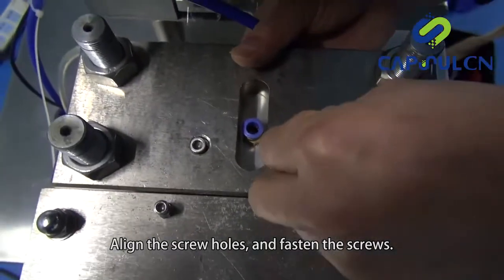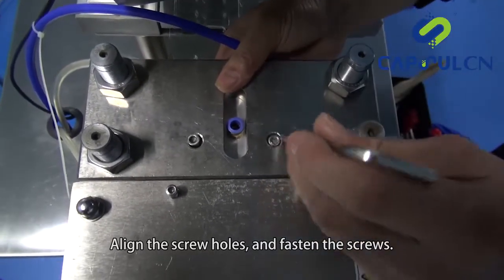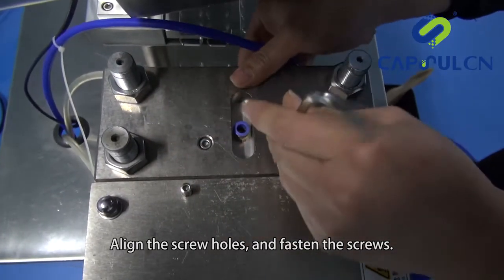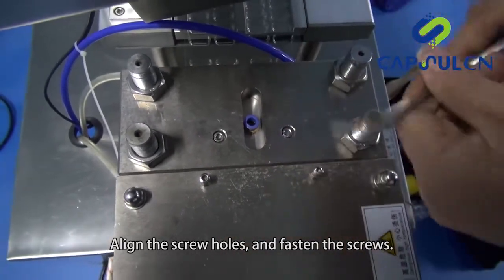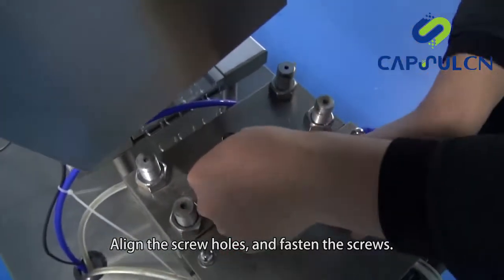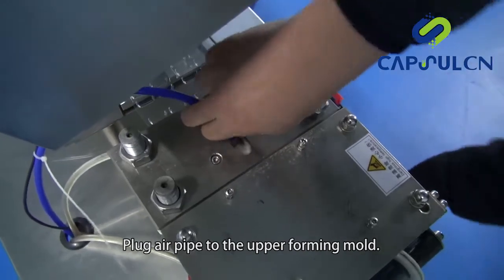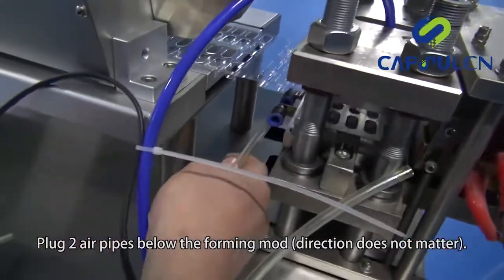Align the screw holes and fasten the screws. Plug the air pipe to the upper forming mold. Plug two air pipes below the forming mold.